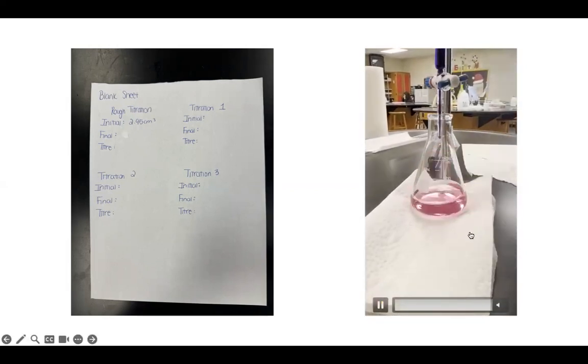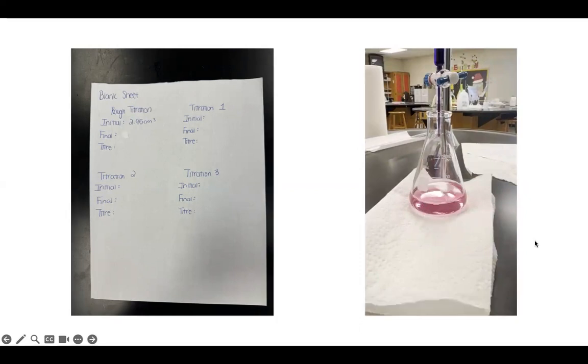So at this point, you see that we have a pinkish color. That means the amount of Fa2 we added to the solution is more than needed, because the purple color is overpowering the clear color that we had at the beginning. Right now we added more than we needed, but this is the rough titration, so that doesn't really matter. It just gives us a rough estimate of the amount that we need. Remember to always swirl as well during the titrations.